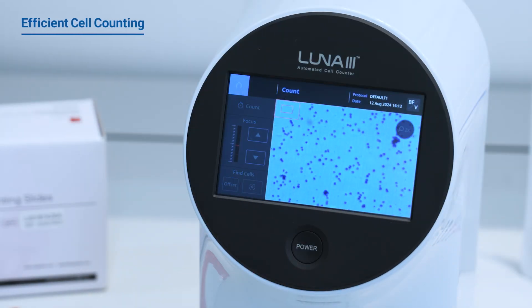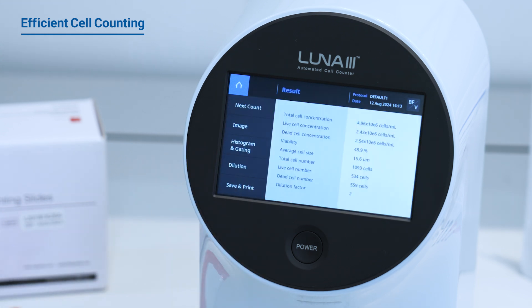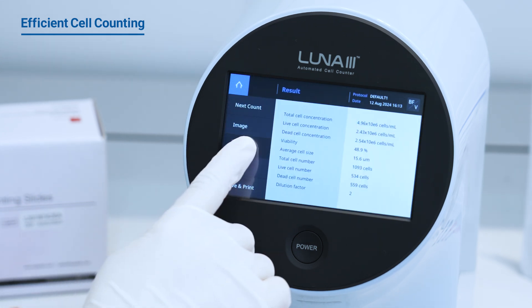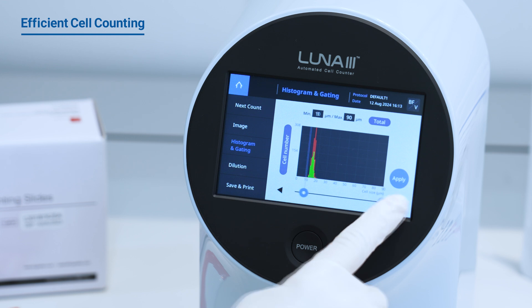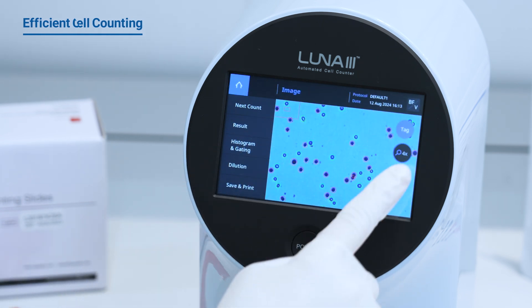Simply press count and the Luna 3 takes care of the rest, instantly bringing your cells into sharp focus, adjusting light levels, capturing a high-resolution image, and analyzing it to deliver precise cell count and viability data.